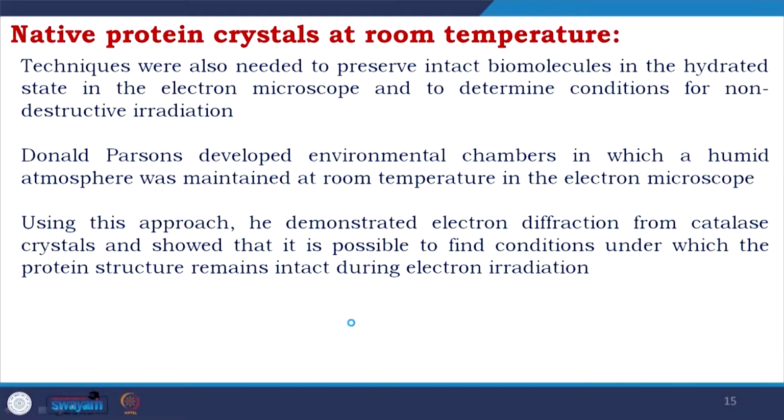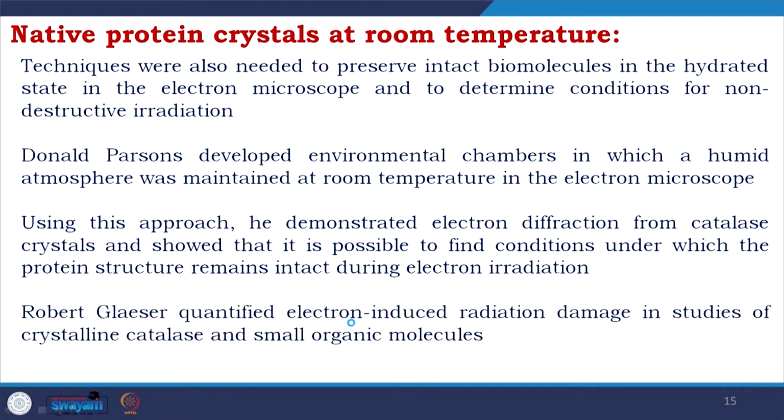Using this approach, he demonstrated electron diffraction from catalase crystals and showed that it is possible to find conditions under which the protein structure remains intact during the electron irradiation. Robert Glaeser quantified electron-induced radiation damage in studies of crystalline catalase and small organic molecules, contributing very significantly to further advancement of the field.